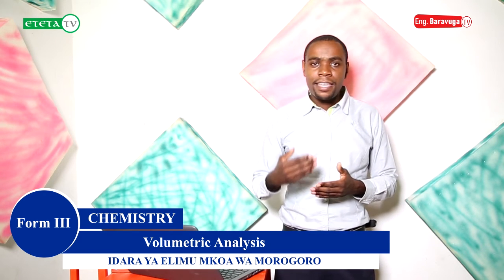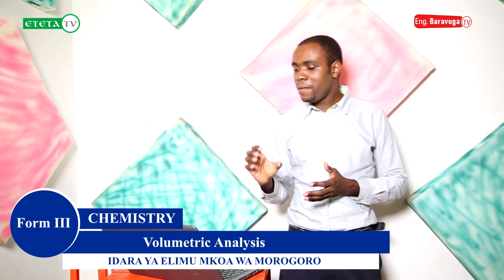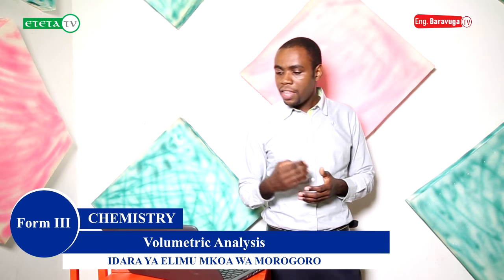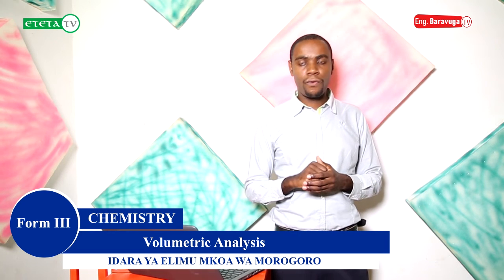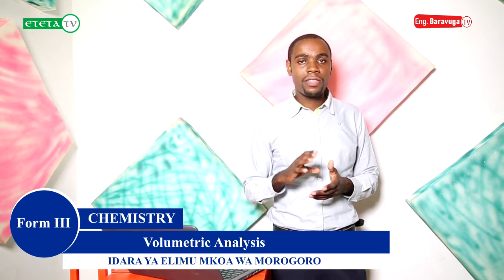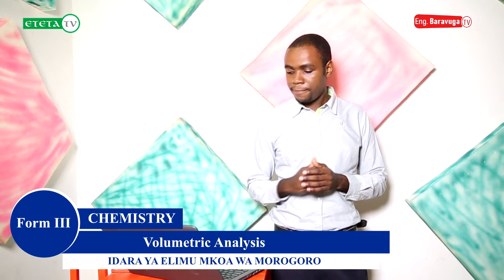Another apparatus is called the measuring cylinder, and the function of the measuring cylinder is to measure the volume of a solution, but not very accurately. This one is used to measure the volume of a solution, but not very accurate compared to the burette.